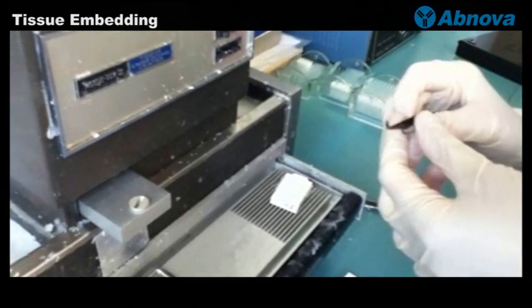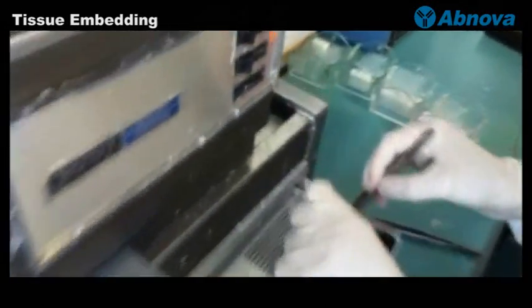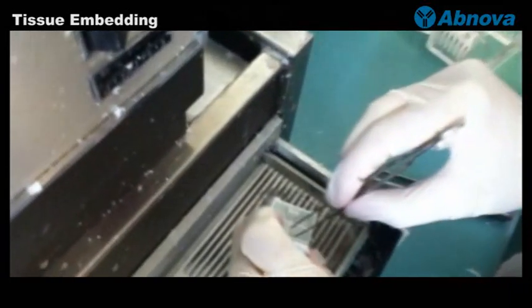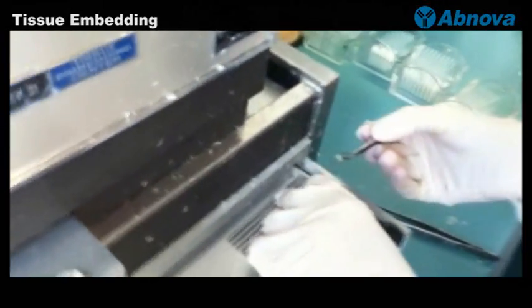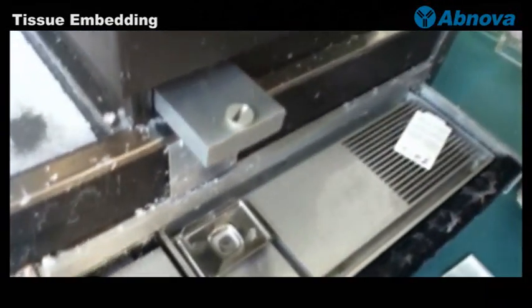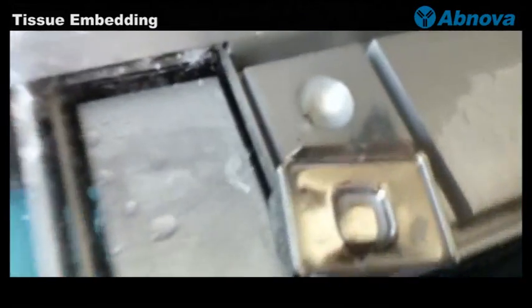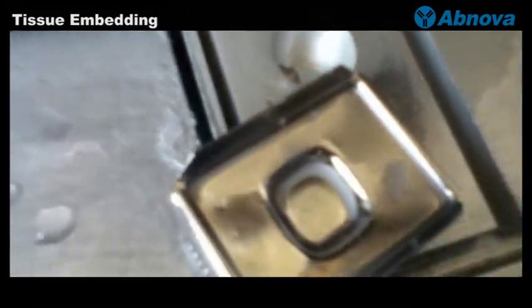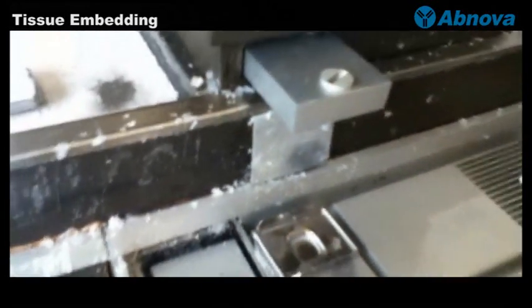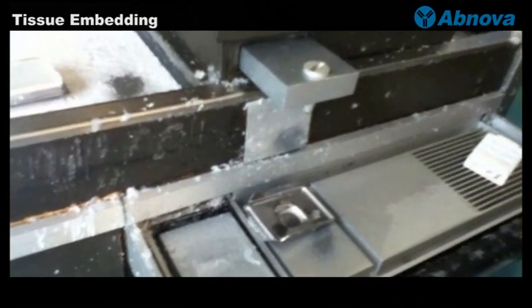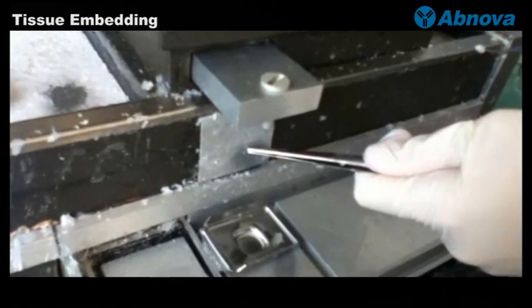You can remove the lid from the cassette and take out the bone chips or tissue that has been processed. Pre-warm all the metal cassettes so that the paraffin inside the cassette will be melted, and you can put a little bit of molten paraffin into the metal mold.